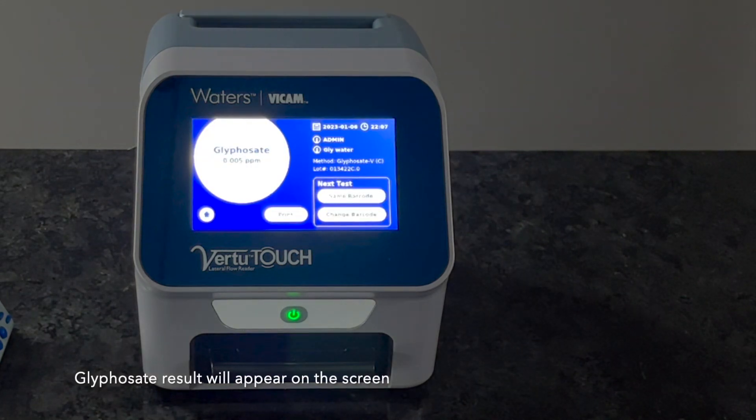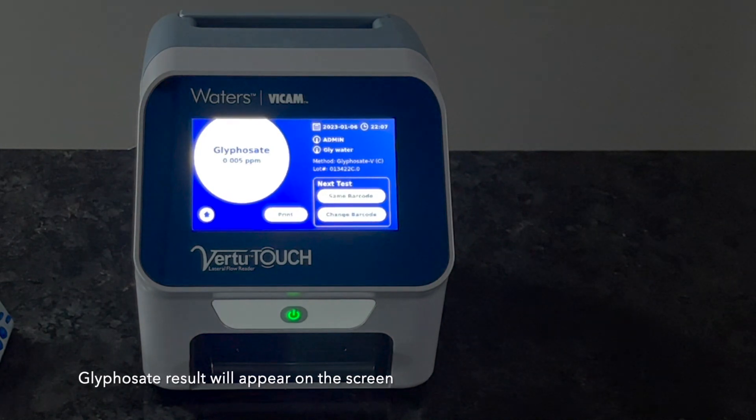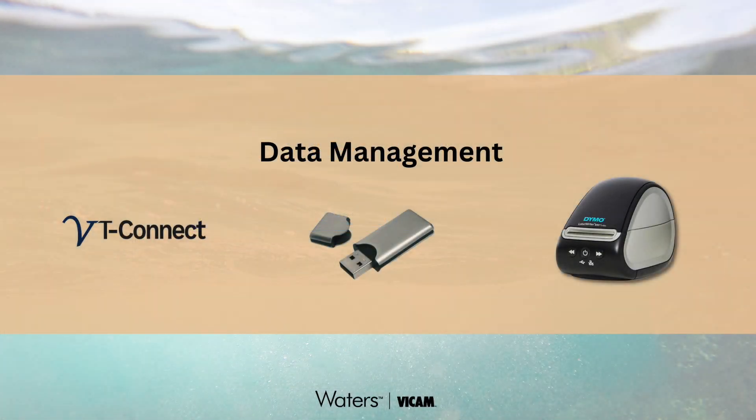Numeric results will appear on the screen. Your results are now ready for use or transfer using onboard storage, USB memory storage, or Virtu Connect software, which enables secure data access and sharing within your operation.